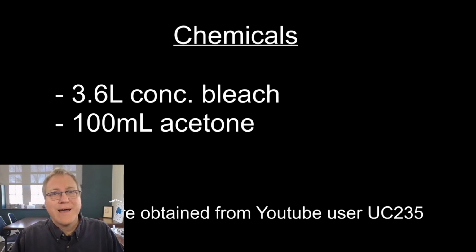Of course, I work in a research lab where if I want chloroform, I can order chloroform. I don't need to make it. But still, this is a really clever way of getting chloroform. Note that he is using someone else's procedure. This is from YouTube user UC235. Unfortunately, when I check this channel, the channel does still exist, but all the content has been pulled down. That's kind of a loss. I'd like to see the original procedure.